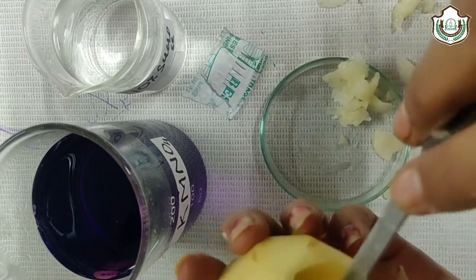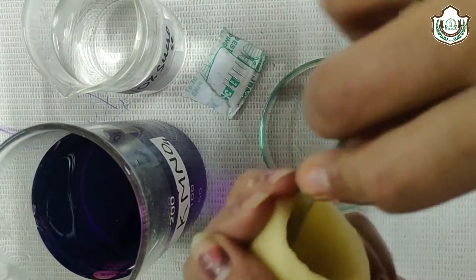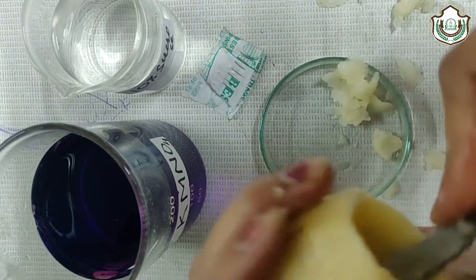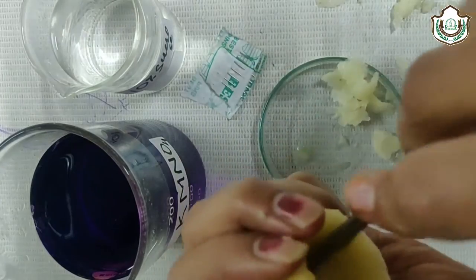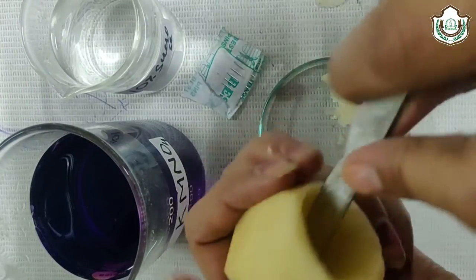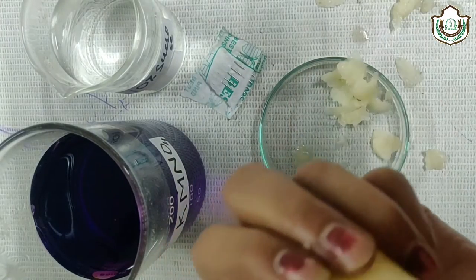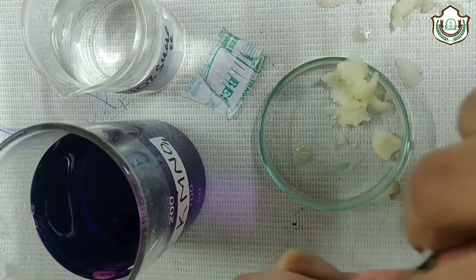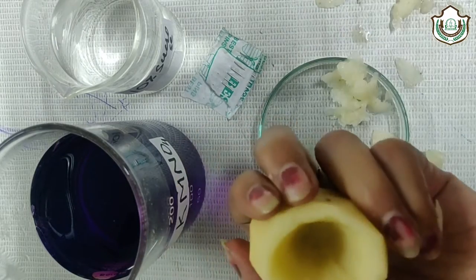Like this. Then the liquid, the sucrose which you pour in the cavity, fill in the cavity, will be leaked out and the procedure, our experiment could not be done. So make smoothly thin layer of potato.